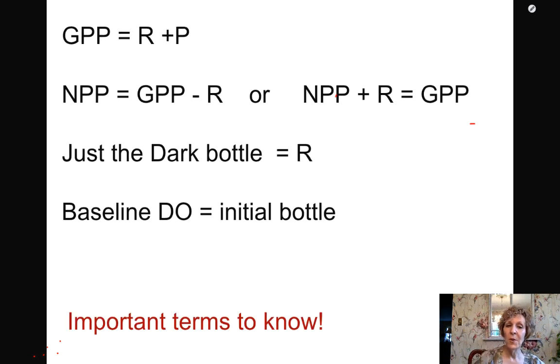So remember those important terms. Remember, just the dark bottle is respiration. The baseline DO is the DO in our initial bottle before we let it sit overnight. And these other equations are going to be important for you to do calculations.